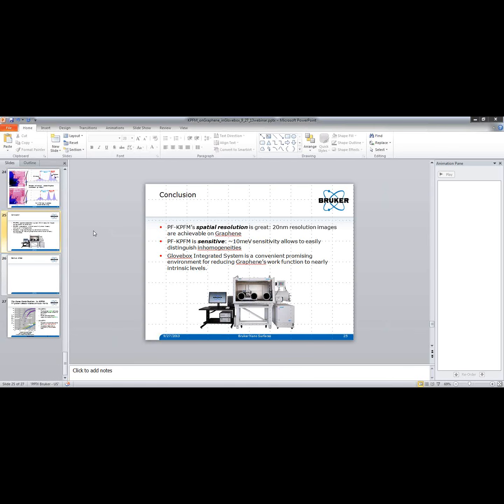Usually, even if graphene is perfectly clean, you still get a huge amount of doping from the water, from the moisture and the oxygen that's dissolved in the moisture that's absorbed onto the graphene, and you also get a huge amount of doping from the substrate that's underneath the graphene as well. And this is charge transfer interactions.